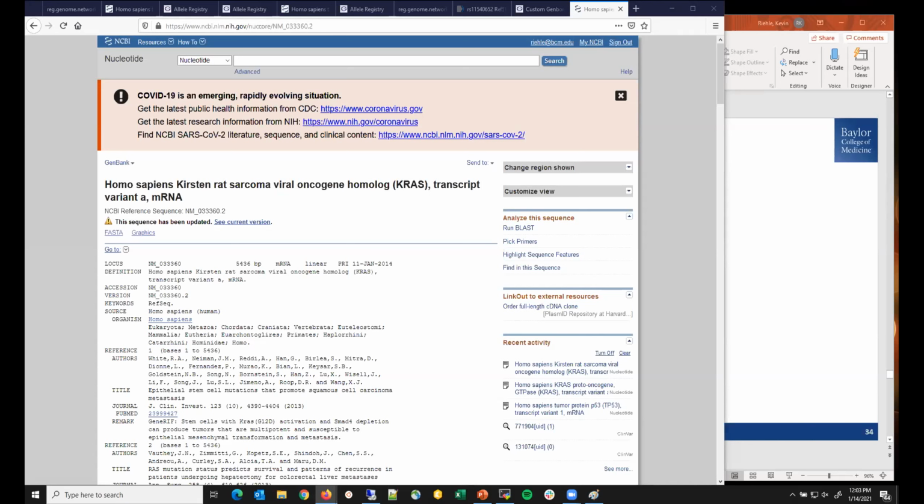The way we handle this is we do on-the-fly mapping in terms of generating the amino acid change. So if the coordinates are the same, if you started off with genomic or with the transcript, it should result in the same change, because it would be based on sequence identity. I would have to look at an exact example to verify that, but that doesn't immediately concern me in terms of the underlying Allele Registry.